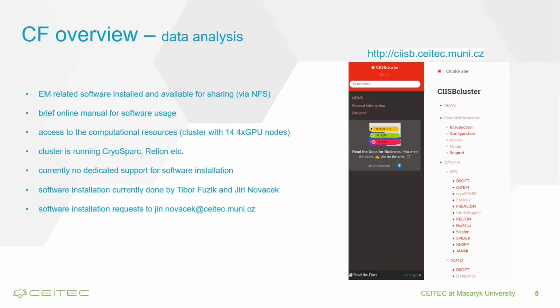It is primarily for running programs for single particle analysis, like CryoSPARC or RELION. Most importantly, we've created this web page with a short manual for each of the software packages available there. If you're unsure or if you're new, please refer to the web page first. There might be some information that will give you a quick start.